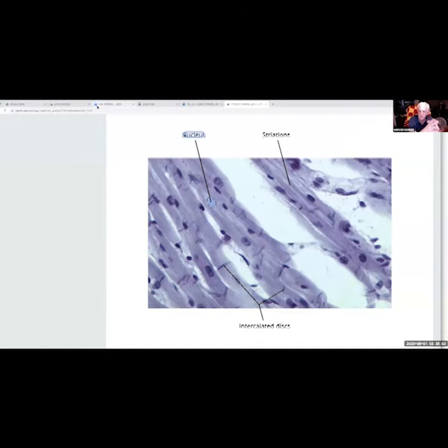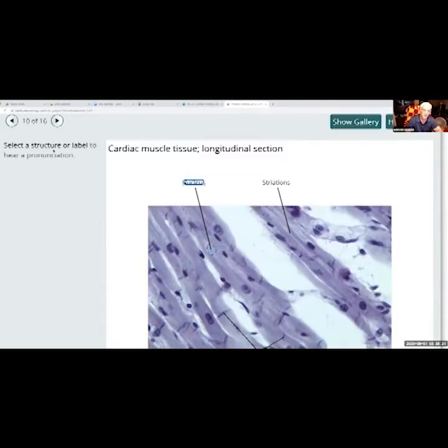Does that all make sense? Those are the differences. And I guarantee you'll see that on your final, on your midterm. I think on your midterm too. I'm gonna give you examples of a slide and I'll give you a nice picture. I won't give you something that you go, well, I mean, that's gonna be obvious. Okay? If you know what you're looking for. Okay, so those are the differences. Those I want you to see. Now, smooth muscle. No, we're not in smooth muscle yet.